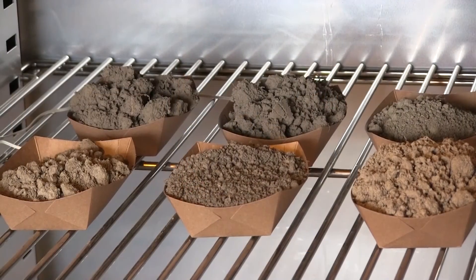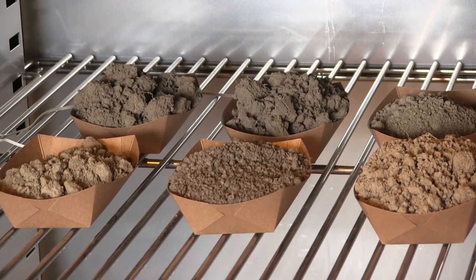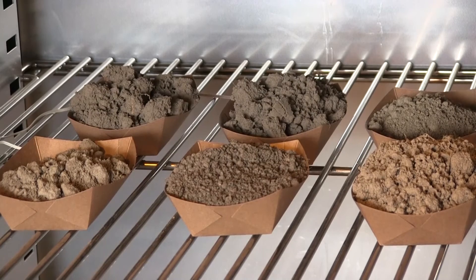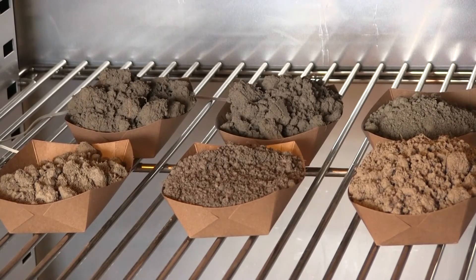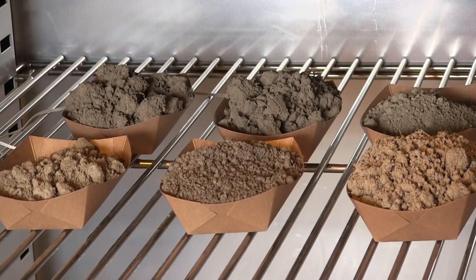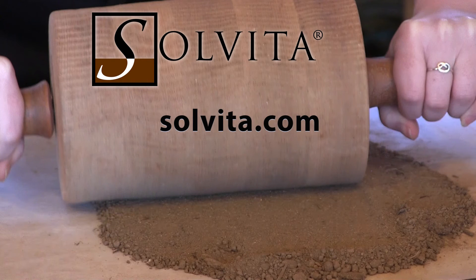We believe that in order to develop commercial scale soil biology testing, we need to protect soil's natural original conditions in the lab as much as possible. These soils all represent differing levels of soil biological quality. The low impact soil handling methods make it possible to more accurately test water stable aggregates and soil CO2 respiration. We hope you found this video interesting and we will be very happy to hear from anyone who wishes to pursue developing these kinds of soil handling and soil testing methods.